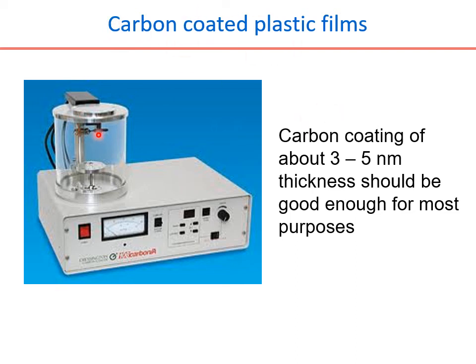The carbon coater will have electrodes, the carbon electrodes, and the copper grids here, and the carbon that is coming from here is sedimented on the grid. By monitoring the thickness on it, either here or with our in-house technique, you can monitor the thickness and stop the experiment. The same setup can also be used for glow discharging. The purpose of glow discharging is basically to minimize or nullify the hydrophobic effect of the carbon film, thereby allowing you to use hydrated samples, or samples suspended in water.